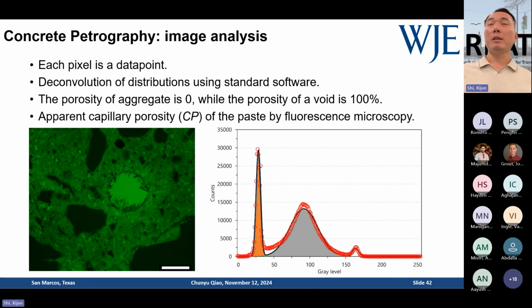So for example, we have an image here. If we extract different levels, each pixel has a different, let's say, gray level or brightness. If you summarize that from 0 to 255, which is a typical 8-bit image, you will see three different peaks of pixels or brightness over there. The lower end, the sharp, tall peak, actually represents those dark particles on the left image.